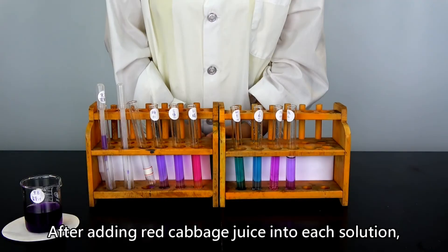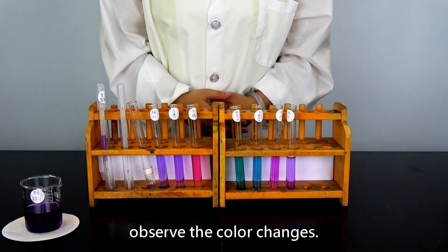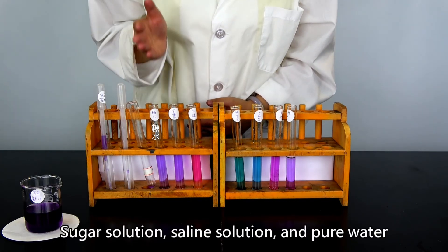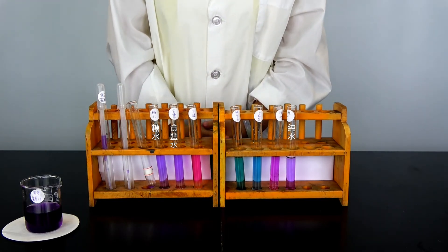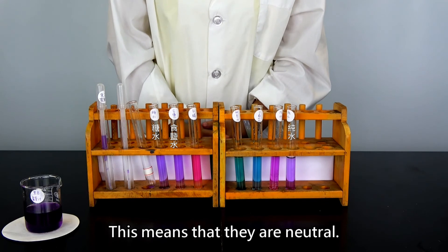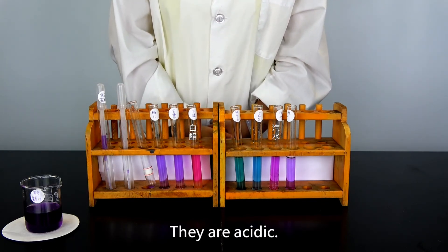After adding red cabbage juice into each solution, observe the color changes. Sugar solution, saline solution, and pure water turn purple — this means that they are neutral. Vinegar and soda are reddish; they are acidic.